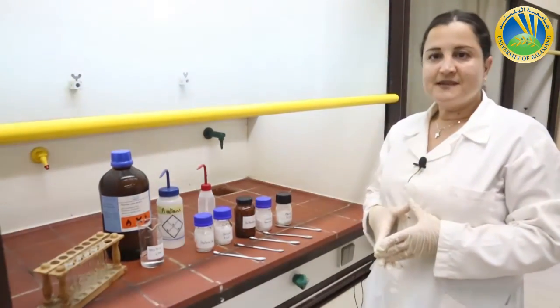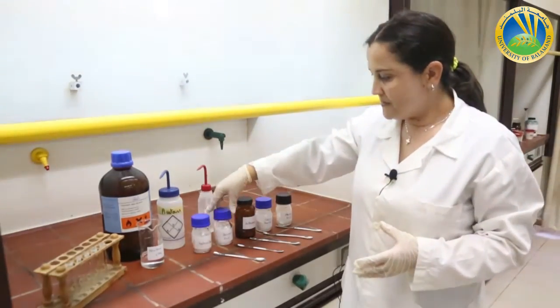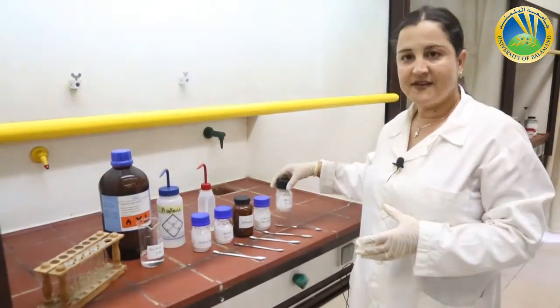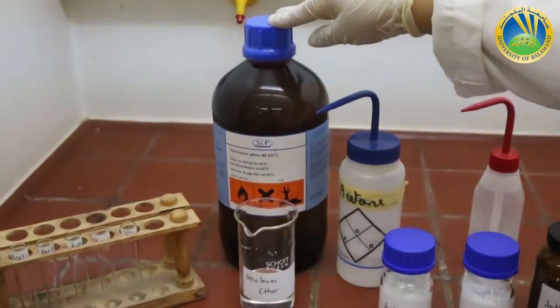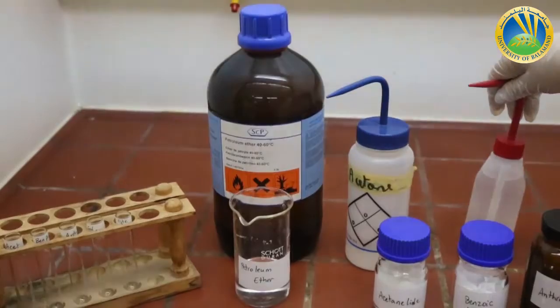The chemicals that we are going to use today are acetanilide, benzoic acid, anthracene, sodium benzoate, and stearic acid. The three different solvents that we are going to use are petroleum ether, acetone, and distilled water.